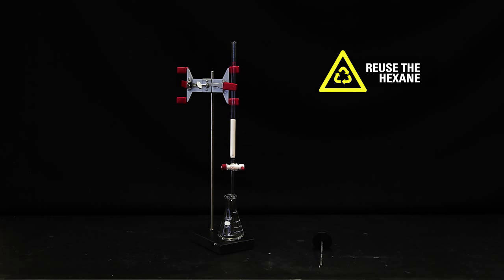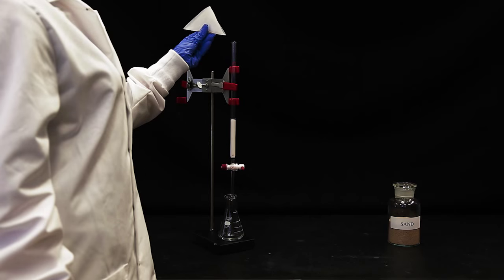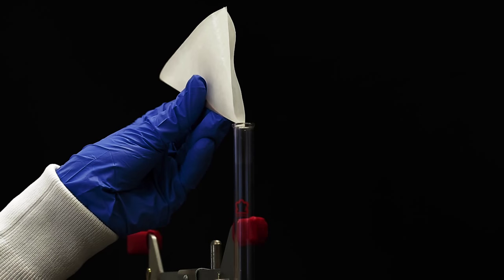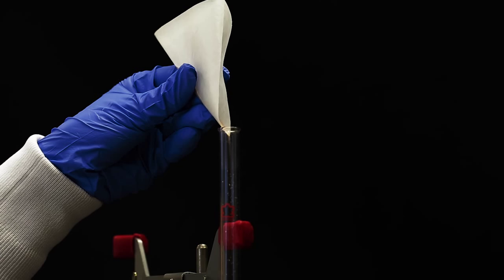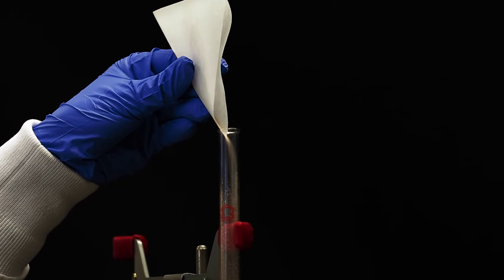Make sure to reuse the hexane collected to prevent wasteful use of solvent. Add a layer of sand to the top of the alumina. This keeps the alumina from being disturbed when more solvent is added to the column. It only takes a small amount of sand.